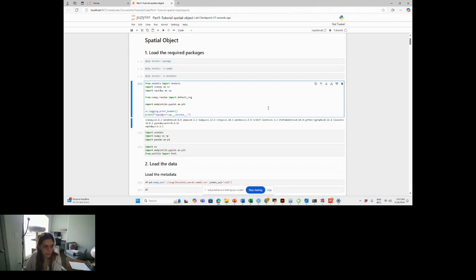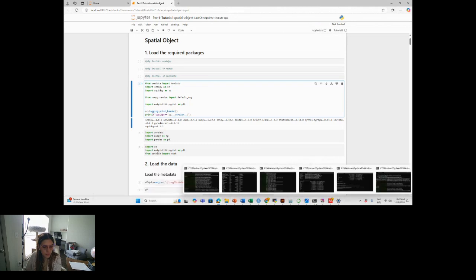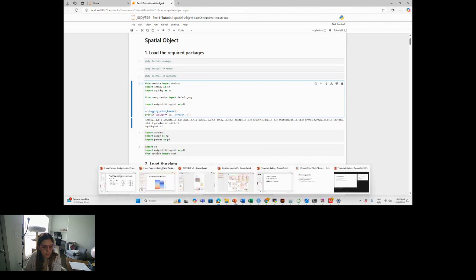So now you have everything you need. But getting to this point takes some time, because of the reasons that we explained. The installation of the environment means that you are collecting libraries from different repositories and installing them in your system to have the right versions. Once you get to this point, the processing in the tutorial is all done in Jupyter.